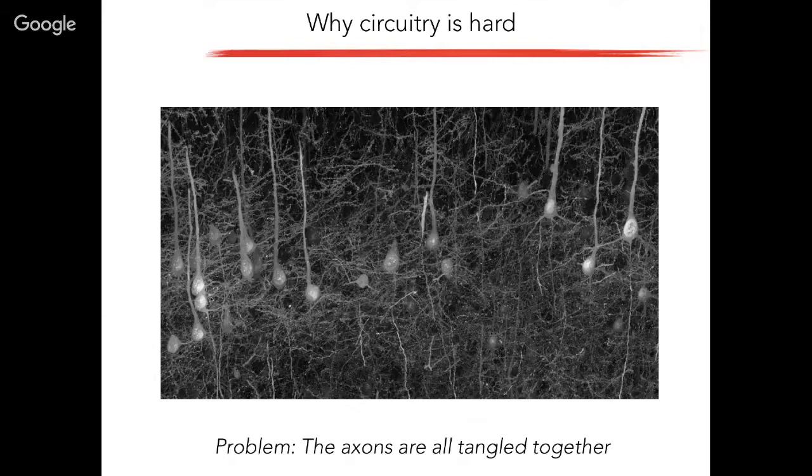Of course, with serial electron microscopy, that's increasingly possible, and yet that remains very slow. And the challenges are not just in the data collection, but in the data analysis. And although that technology is improving rapidly, I'm going to propose that there's a shortcut that complements the EM approach.